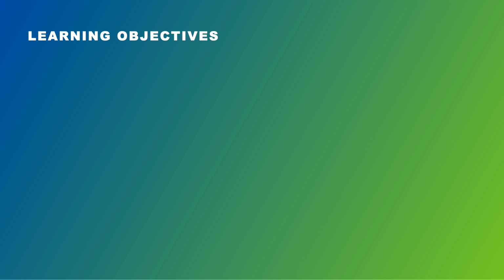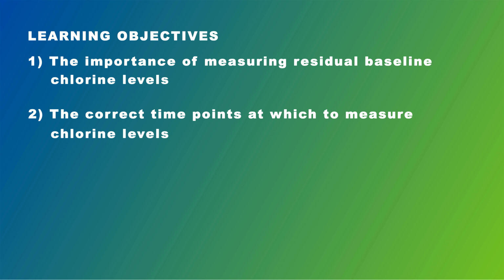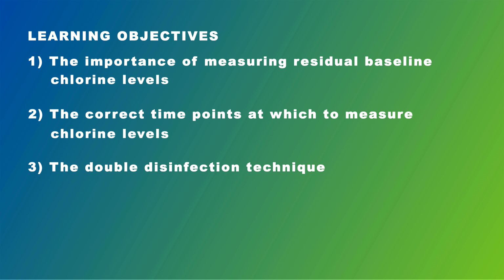In this video we have three specific learning objectives that we'd like you to achieve. Firstly, we'd like you to understand the importance of measuring residual baseline chlorine levels. Secondly, we'd like you to be clear on the correct time points at which to measure chlorine. And finally, we'd like you to become familiar with the double disinfection technique for disinfecting taps before you proceed with your microbiological sampling.